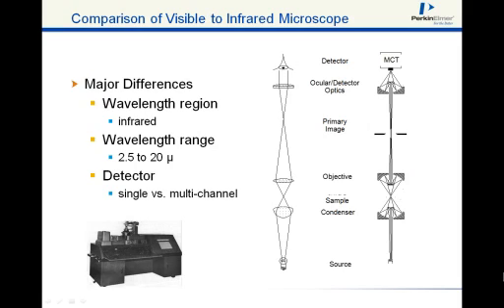So what is an infrared microscope? And I should point out down at the lower left is the original infrared microscope. That is the Model 85. It was introduced by PerkinElmer in 1968, a little before my time. Okay, on the left is a stick diagram, if you will, of a visible microscope. The stage is where my cursor is at the moment.